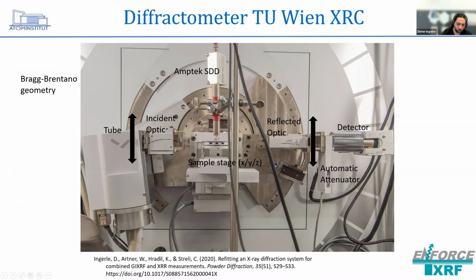Of course, the more problematic side in this case was actually the software side, because we had to synchronize the detection of the fluorescence spectra with the acquisition of the reflectivity and the movement of the motors for the angles. But otherwise, it's relatively straightforward to set up and gives very good results.